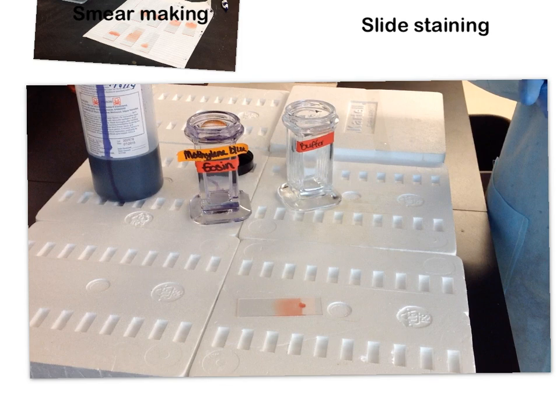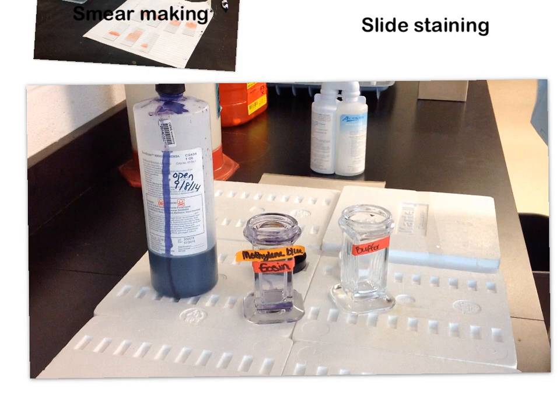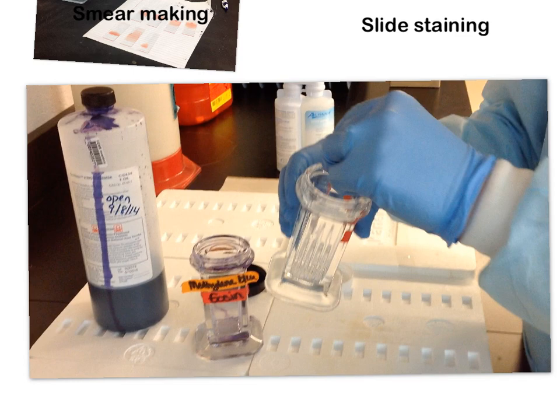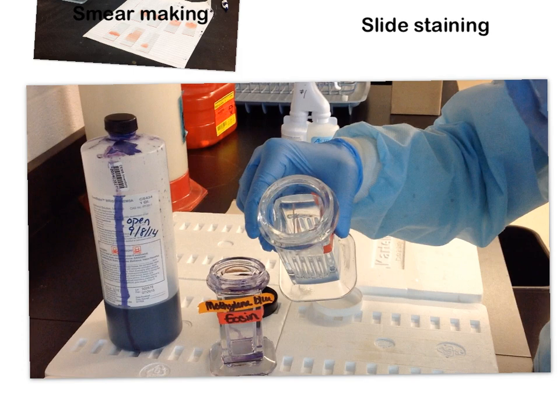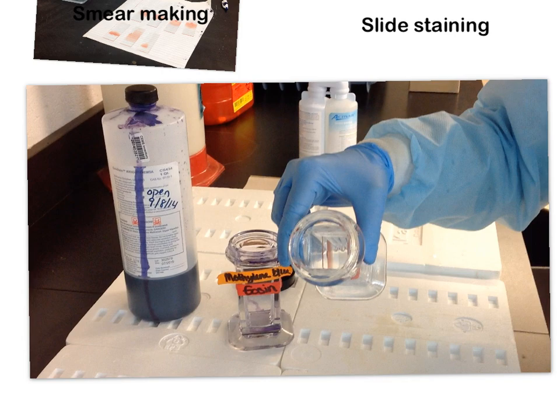There are two different ways to stain. The first is using Coplin jars, which I'll show you today; we also have staining bars. Coplin jars are neat because they have little troughs where your smears sit while being stained. The troughs ensure surface area contact with the stain or buffer and prevent slides from touching each other — as long as you don't put your smear in the same trough as someone else's.